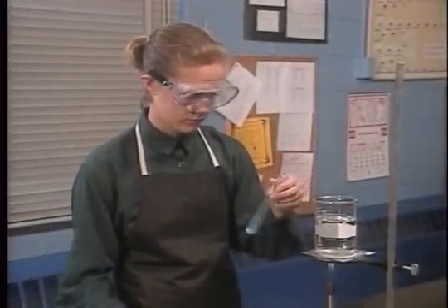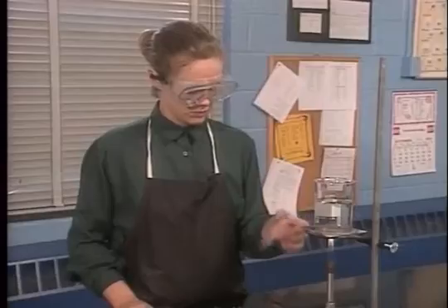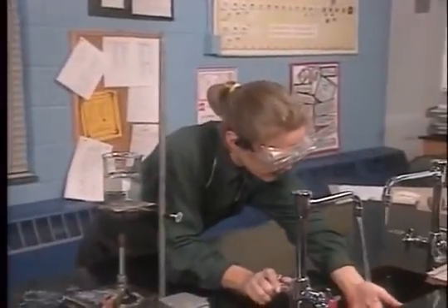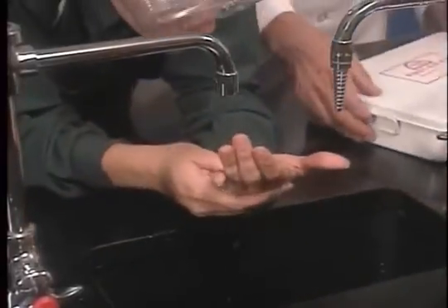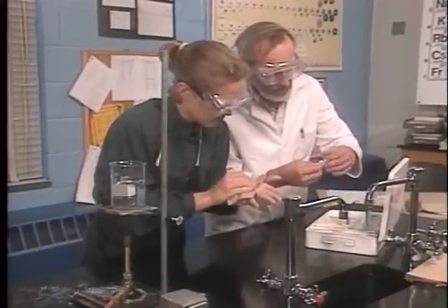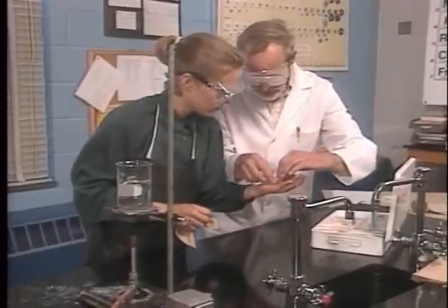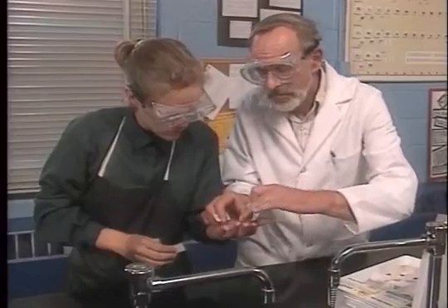In spite of safety precautions, people sometimes get careless and accidents happen. That's why a well-equipped chemistry lab has emergency equipment to take care of them. If you've cut yourself, wash the wound to remove any chemical traces. Make sure there are no pieces of glass in the cut. Dry your skin carefully so a bandage will stick. Let your teacher put the bandage on the cut. Notify your teacher whenever you have an accident. And make sure to get immediate medical attention after any injury in the lab.